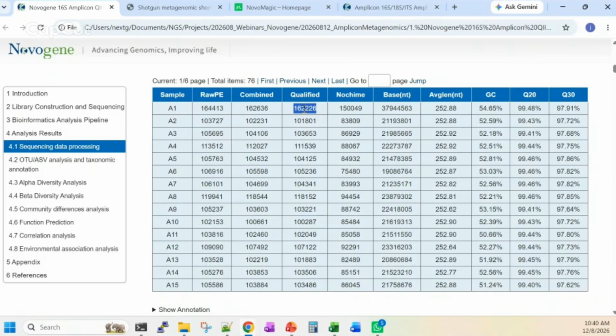So whether it's a full target or full amplicons from the samples. And then it will also try to check whether there are any chimeras. Chimeras are maybe a mix of one sample with another sample in the same sequence. So this is considered a chimera, and then it will try to exclude it. The remaining ones are the non-chimera ones. So we have around this number of tags remaining, and then this total data throughput.